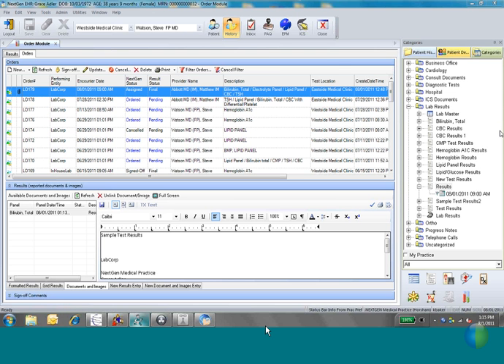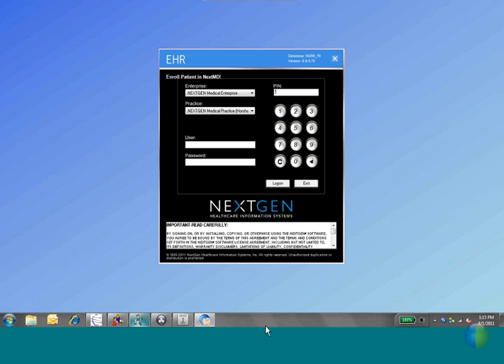Sorry, I missed a couple questions. Are the critical ranges per provider? No, they're not per provider. And in fact, let me test this really quick. I think they might be for everybody, but I'm going to check to see if they're per user.